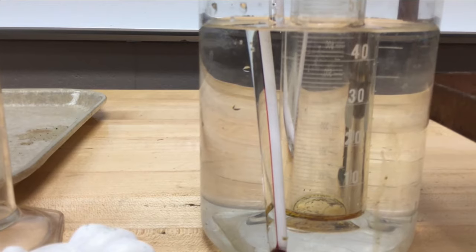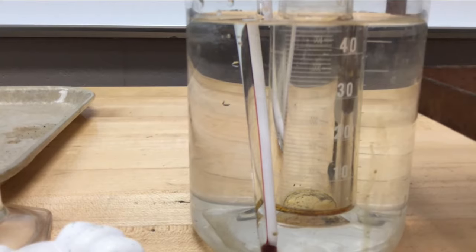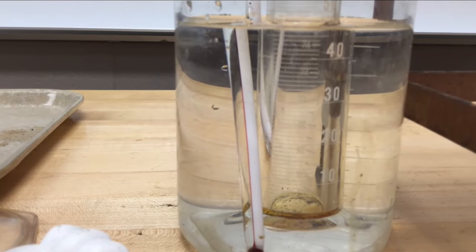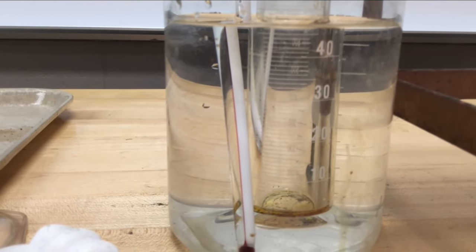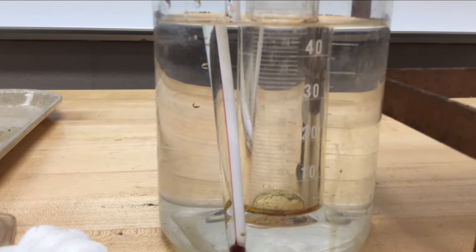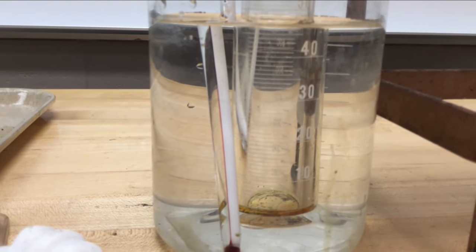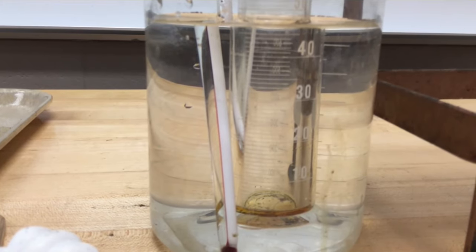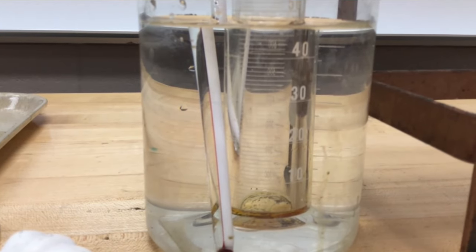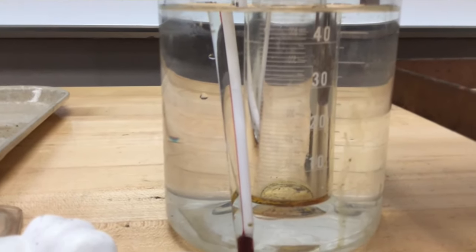I have it going kind of slow right now, so I don't want to heat up the oil too much, where it goes from 200 to 300 within just a couple minutes. I want it to slowly go through there. So I know that if I have 200 milliliters, and I get to the 10 milliliter mark, that's going to be 5%. If I go to the 20 milliliter mark, that's going to be 10% of my initial sample of 200 milliliters. And again, I see a little drip.